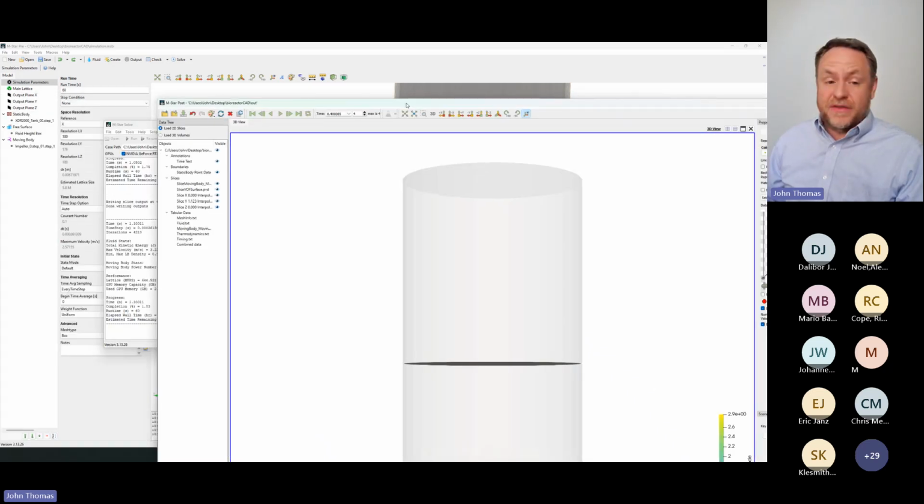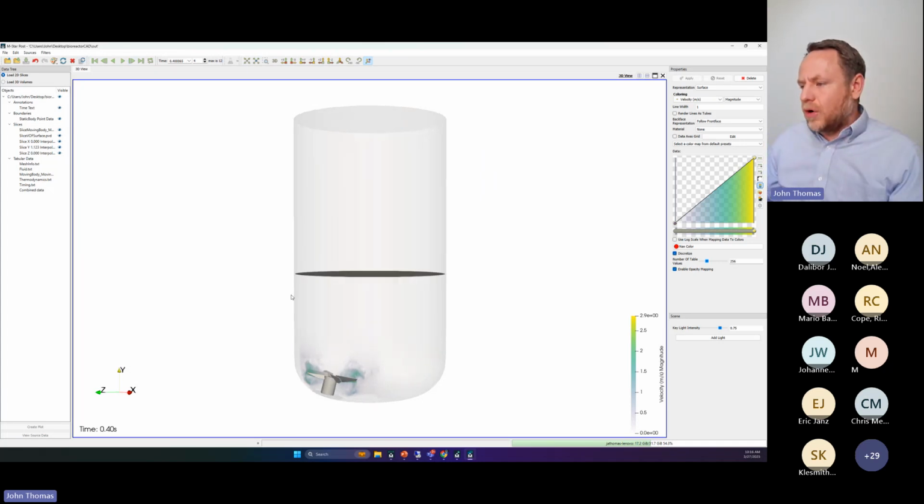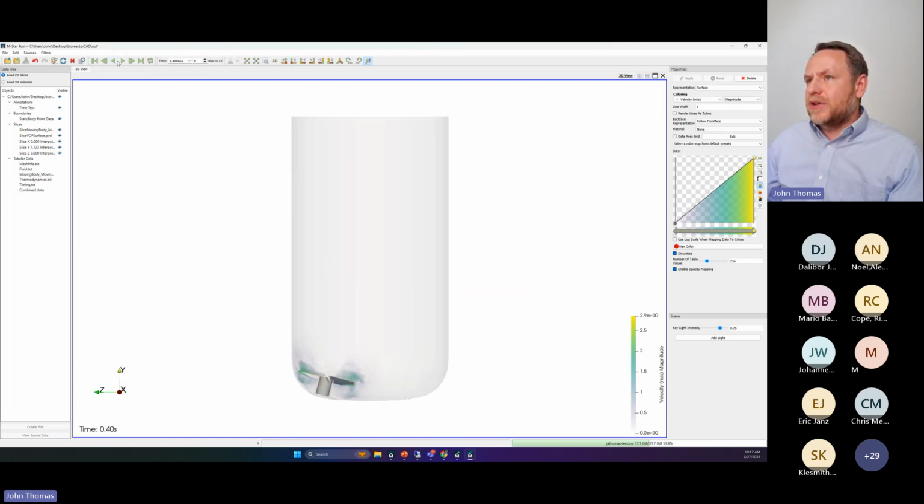And I've talked about this in previous seminars. Instead, I'm going to be doing an LES simulation where I'm resolving past the Taylor scale, but not all the way to the Kolmogorov. But if I look at this guy here, let's just take a look and see what we got coming out of this thing. I can begin to see this impeller starting to spin and the fluid starting to inject. I'm kind of watching this guy process as it's coming.